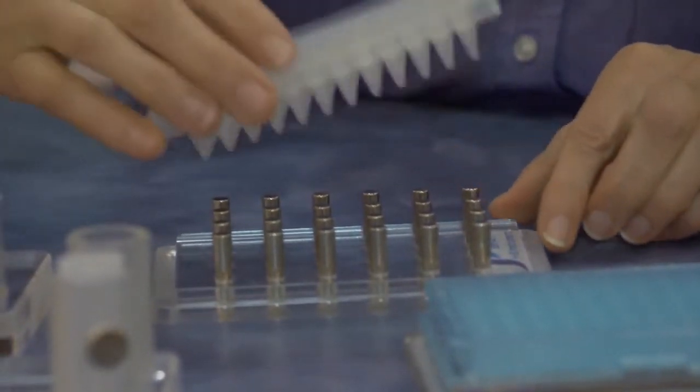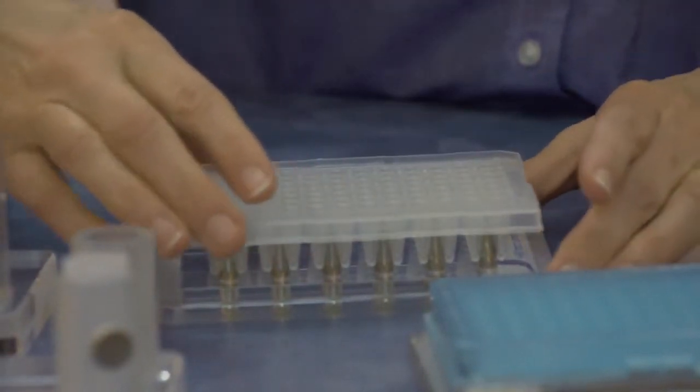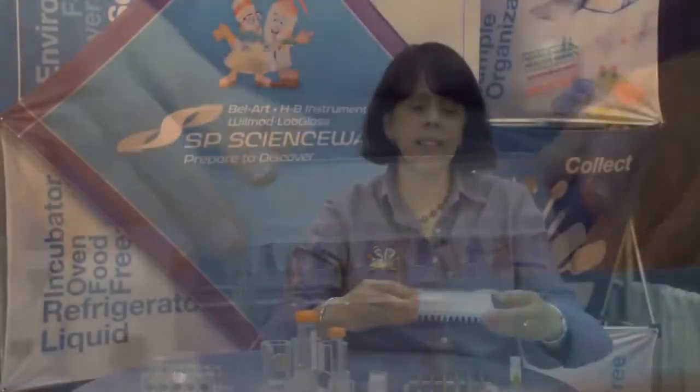Moving over to the microplate racks, our PCR rack has 24 vertical magnets on the top face of the rack. I simply put my conical bottom PCR rack on top of the magnets. It's held firmly in place and the magnets will collect the beads in each tube on the wall of the tube.